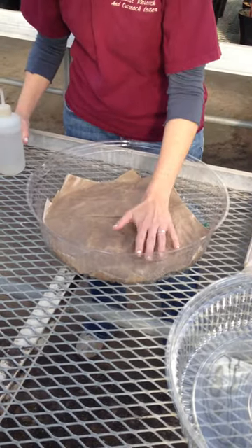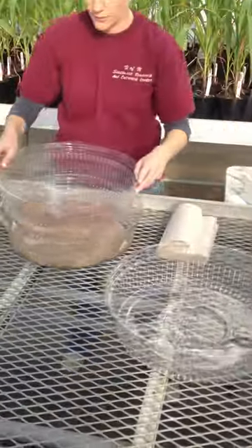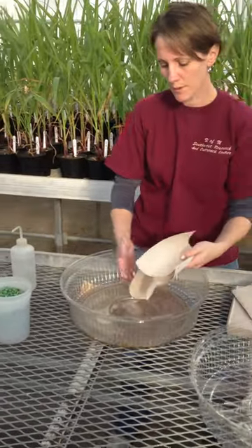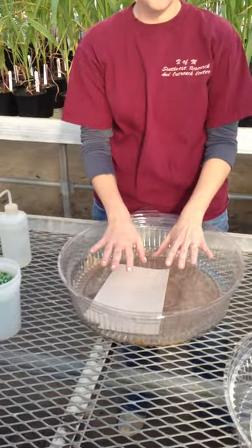Press them so that there's good contact. Then you can take another tray, put it right on top, and do the same. In our experiment, we have corn and cucumbers — the bottom layer is corn, and the top is cucumbers.